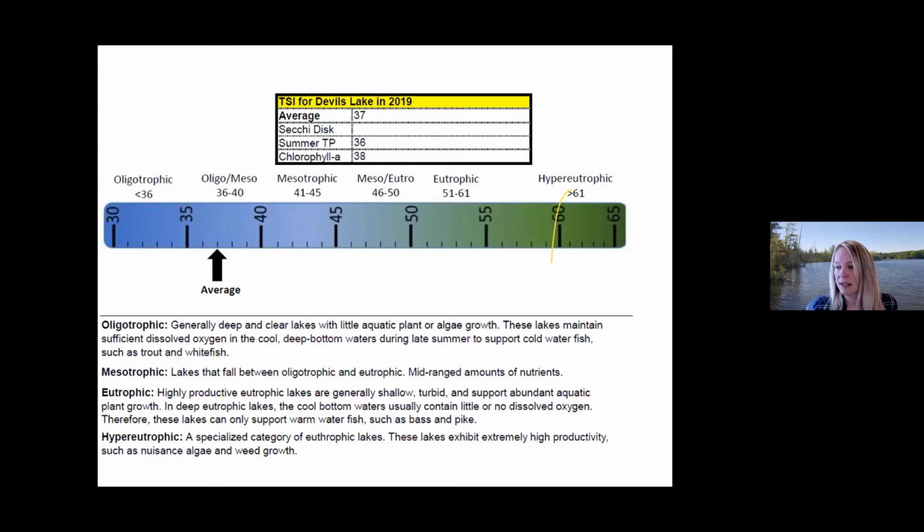All right, another question. In very clear, shallow lakes, I believe the chlorophyll sample is not supposed to be taken at the very bottom for fear of touching the bottom, but 2 or maybe 3 feet off the bottom. Yep. Yeah, don't hit the bottom with your sampling equipment. Then you'd have to sit there for 20 minutes and wait for it to all settle down. Exactly. You mentioned that before, Paul, that it's important to avoid bumping the bottom with our sampling gear.